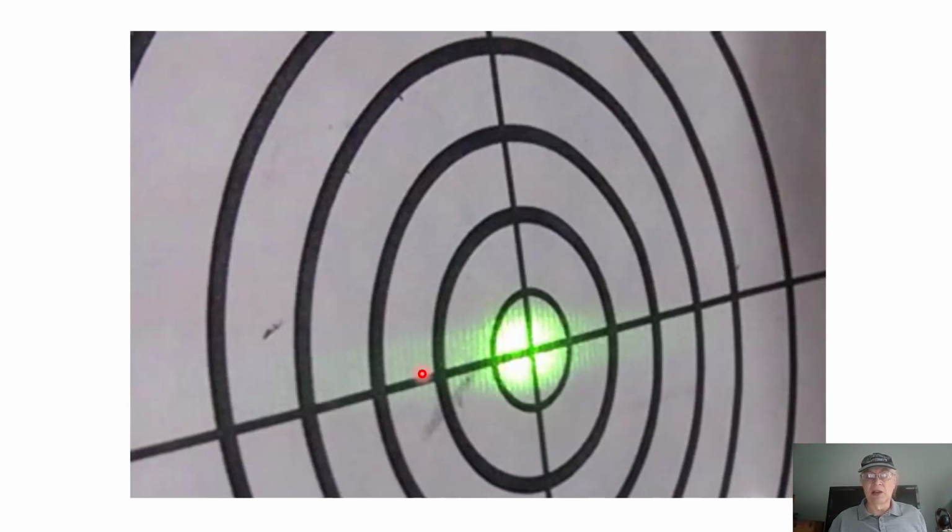It's probably easier to understand if I tell you what's not an inverse method, and that would be any form of microscopy. That's a real space method. So scattering and microscopy are complementary pairs. Scattering is in inverse space, microscopy is in real space. We'll talk more about this.